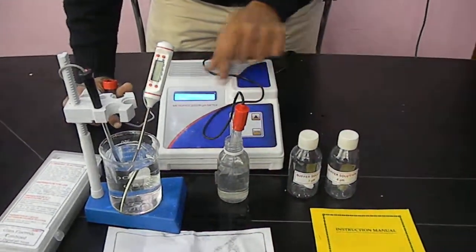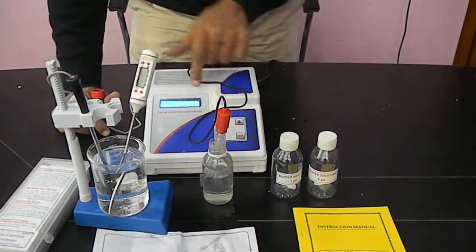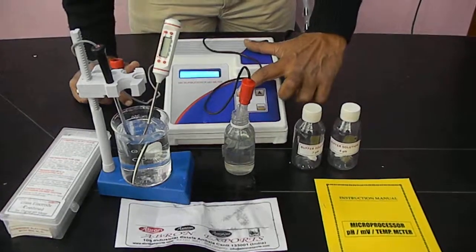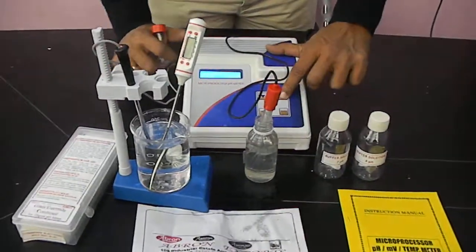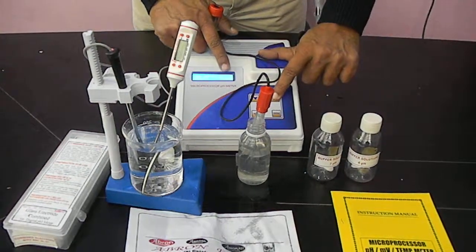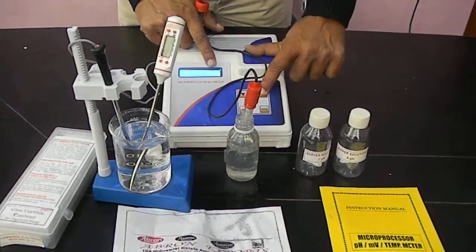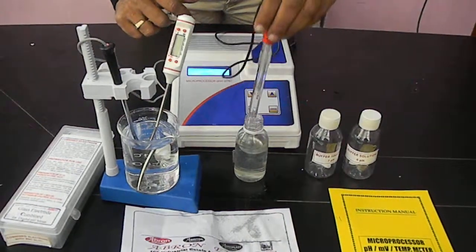If you want to calibrate, first go with calibration — here is a cursor, enter this, and select buffer 1. Enter. This is the pH 4 buffer I am using. I can change this. The visible reading is 3.45. I can increase it and set it to the buffer I see. I am slowly increasing it to 4, then enter. Now this is calibrated.